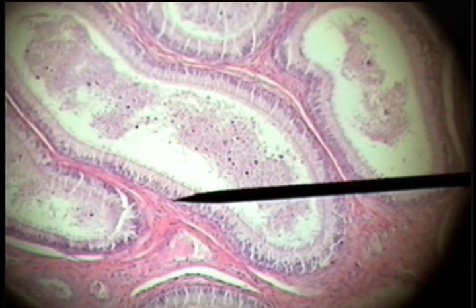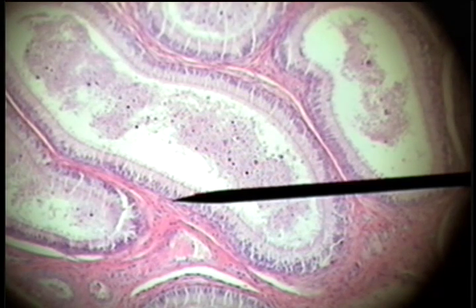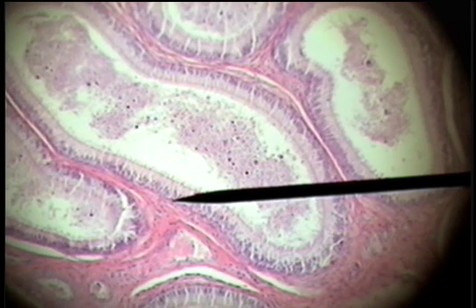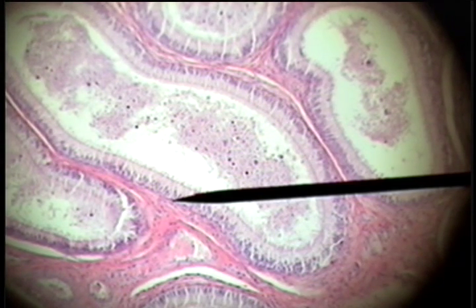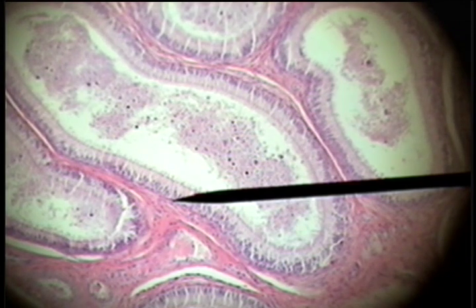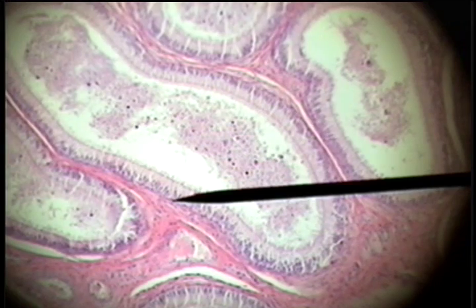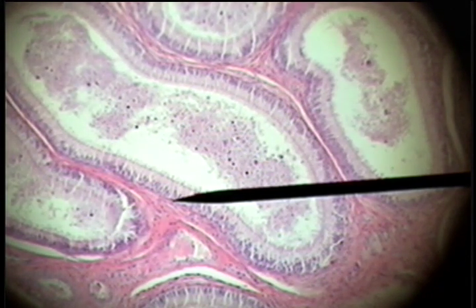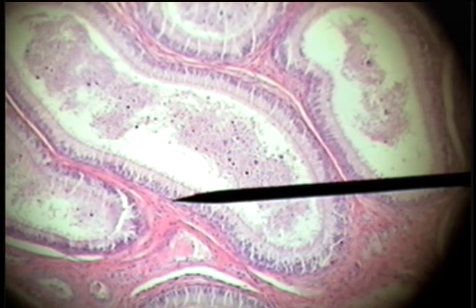Another example of pseudo-stratified ciliated columnar epithelium is found in the epididymis, which is a tubular structure in the testis where gametes or sperm will become activated. This pseudo-stratified ciliated columnar epithelium sits on the basement membrane — the outer wall of the tube — with the lumen of the tube containing the gamete material.